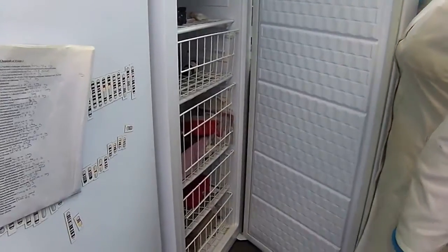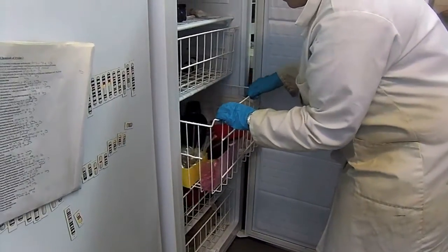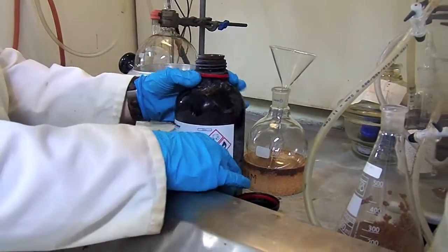The first step in your procedure is getting your pyrrole out of the freezer. The pyrrole should be a clear liquid; however, over time it will polymerize to go either yellow or brown. If this is the case, you will need to distill it.